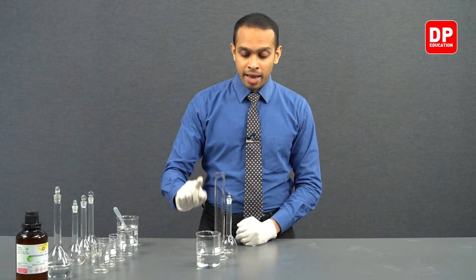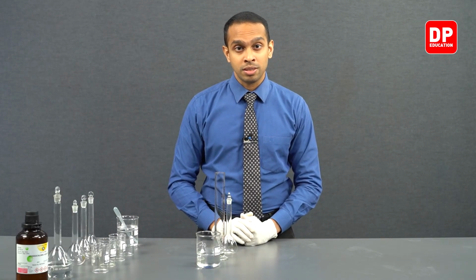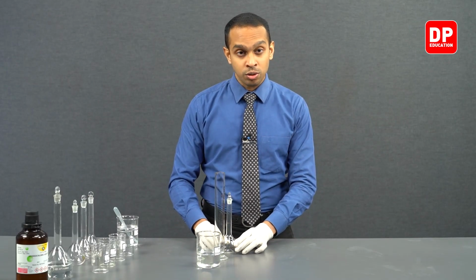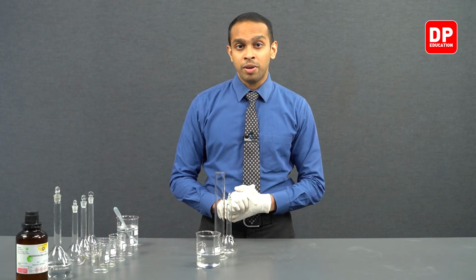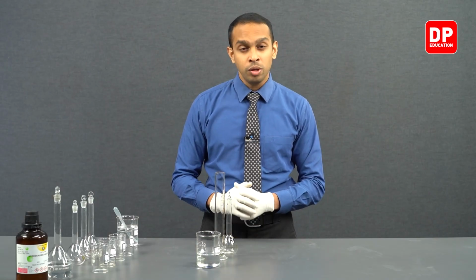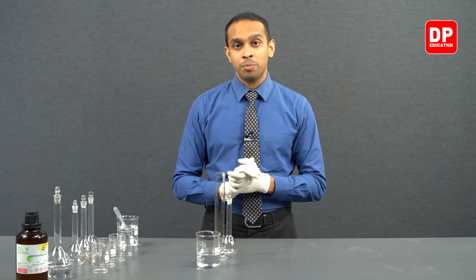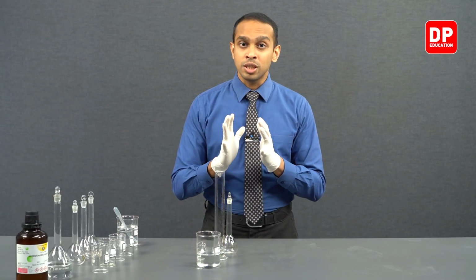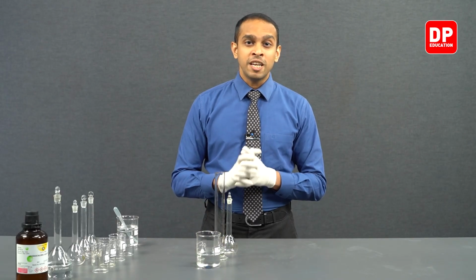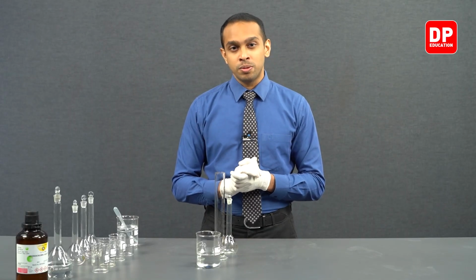So we are going to measure 80 milliliters of 1 mole per decimeter cubed HCl solution and transfer it into a 100 milliliter volumetric flask, and then we are going to add water all the way up to the calibration mark. When you add water and prepare this new HCl solution, the concentration is going to be 0.8 moles per decimeter cubed.